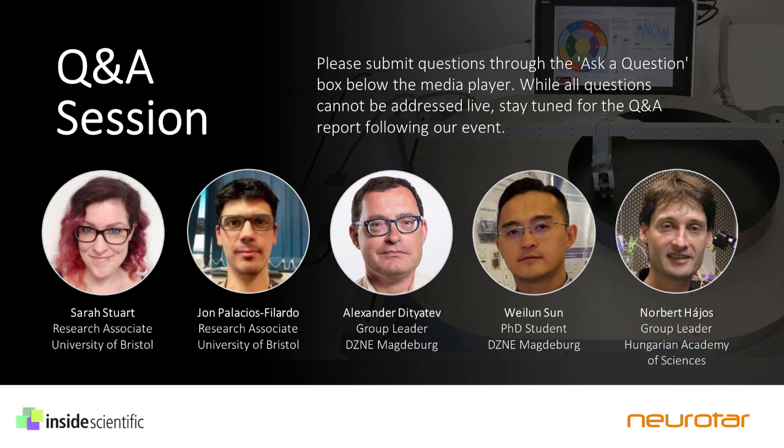All right, perfect. Thanks, Sarah. And in the interest of time, we're just going to make this next question the last one. We received a few questions during registration asking about the challenges of making measurements in moving animals, which John said that he could address here. So, John, how do you mitigate motion artifacts while recording? And how long can you keep a whole cell recording while an animal is actively moving?